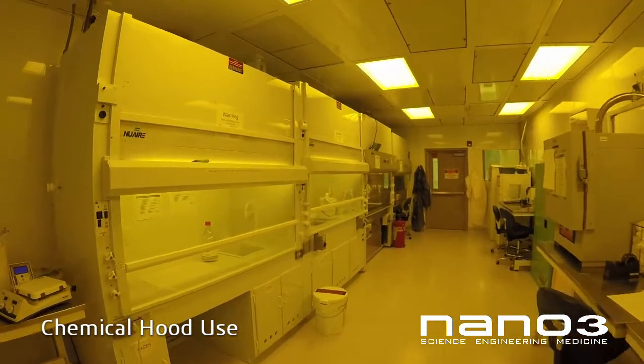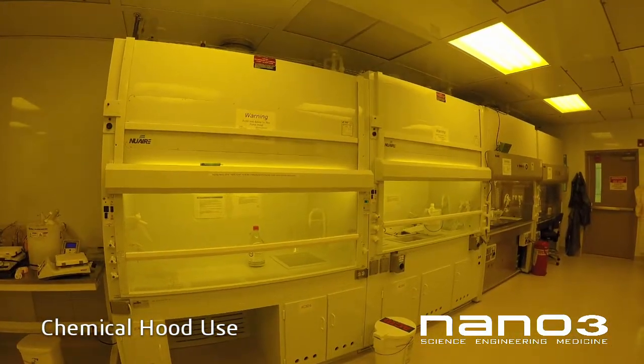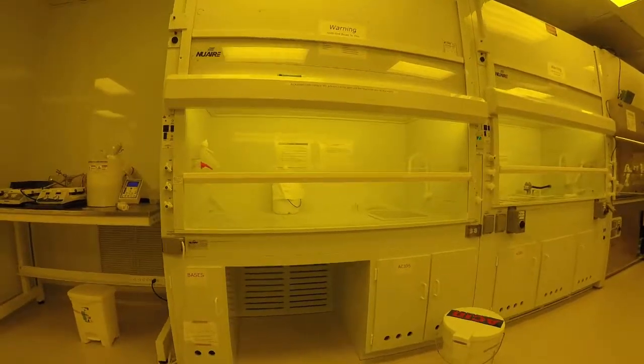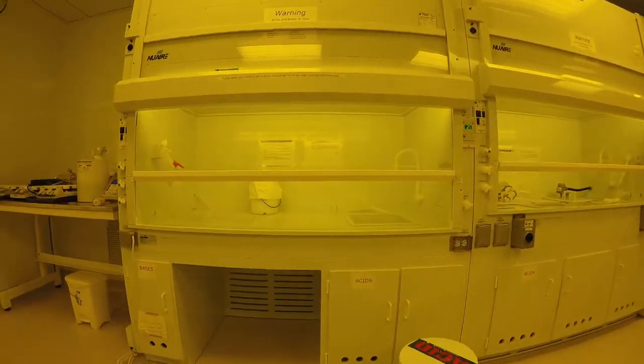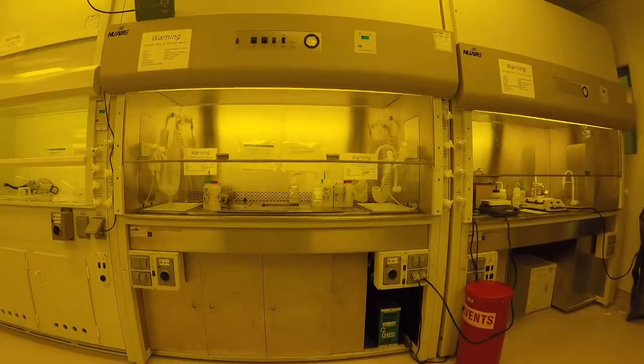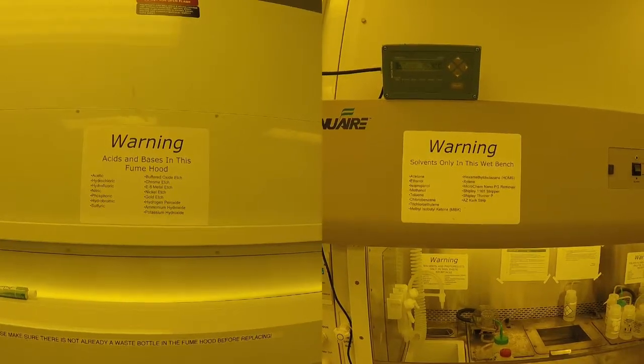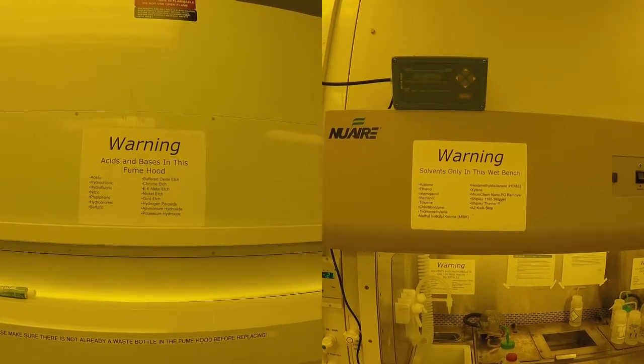Chemical fume hoods are designed to protect users from chemicals, but only if used correctly. The white polypropylene fume hoods are designed for acids and bases only. Stainless steel fume hoods are for organics and solvents only. Please consult posted signs on the fume hoods for allowed chemicals, or ask the Nano 3 staff.